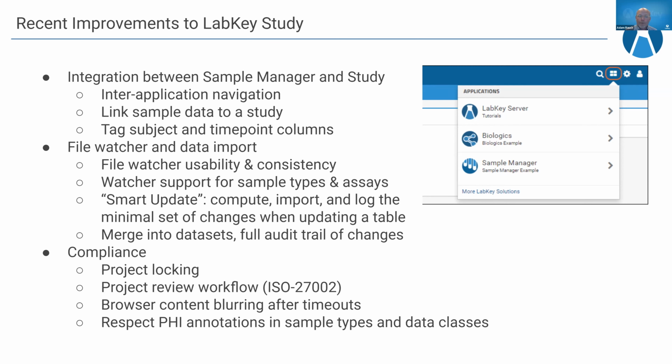We've also made a number of investments on the compliance side, providing the ability to lock a project. Let's say a clinical trial has ended, papers have been published, or a certain experiment has ended. The project is done. We want to keep all that data within LabKey in case it's needed in the future, but you don't want anyone being able to view it or, in particular, change the data. You can simply lock the project with a single click, and that makes it available only to high-level administrators. They're the only ones who can see it. It can be unlocked if needed, but it just keeps the data in LabKey for future needs without making it available to everyone.